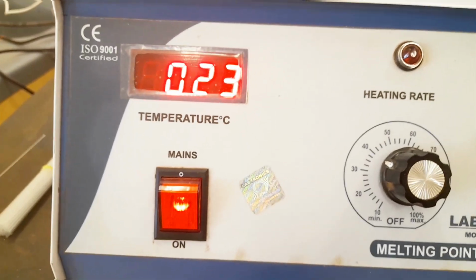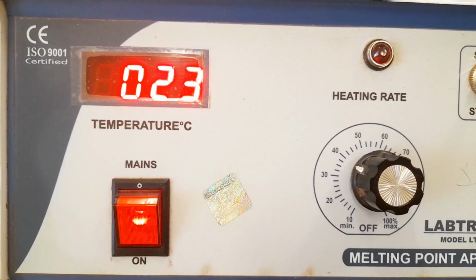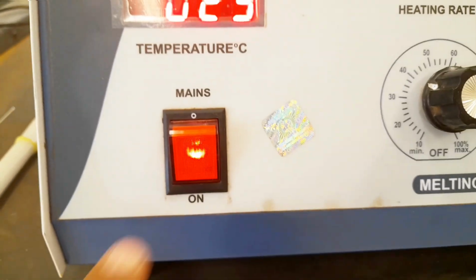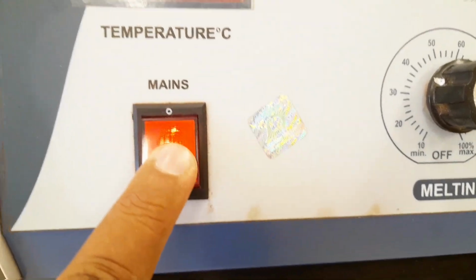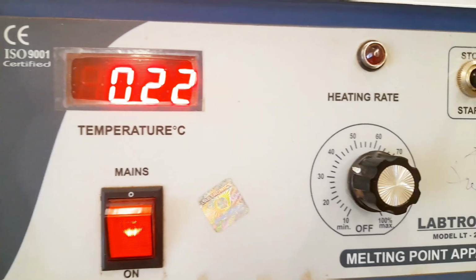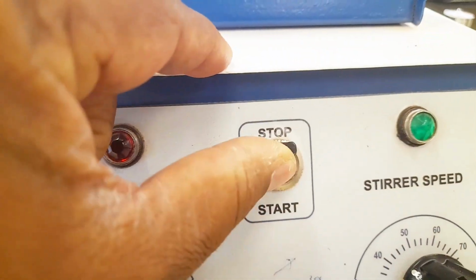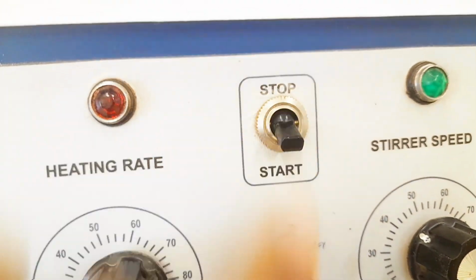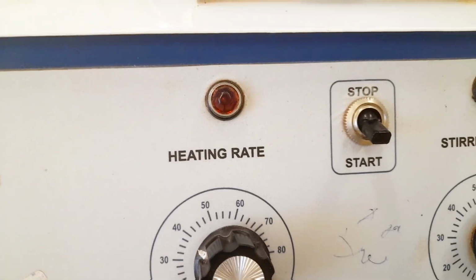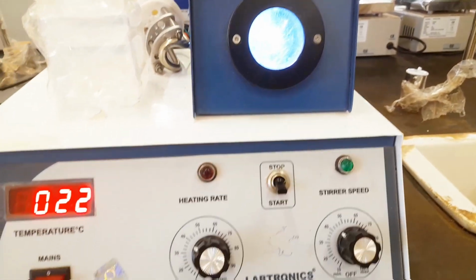This is the temperature display. The temperature of the lab is 23 degrees centigrade. This is the main switch, where we can switch off and on, and the temperature is visible. This is the start button, where we can start and stop. When we switch off the main, all the lights are off, and when we switch on the main, the lights come on.